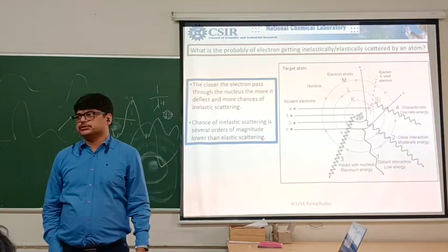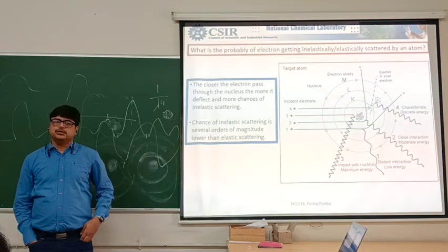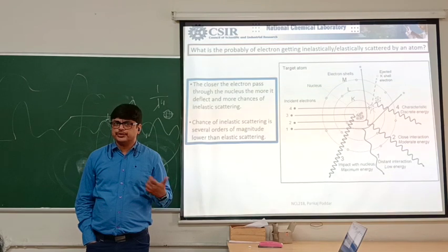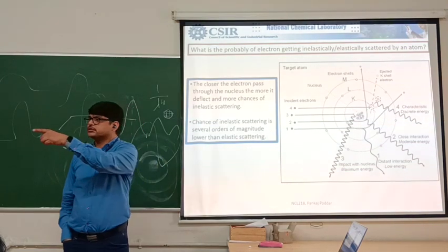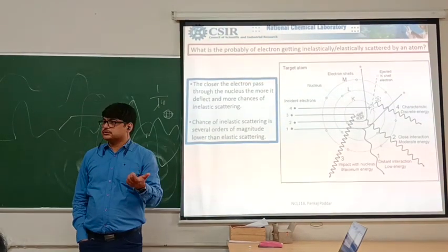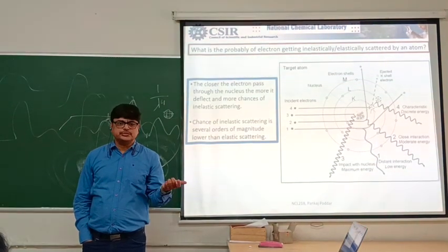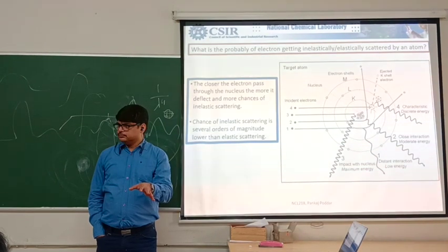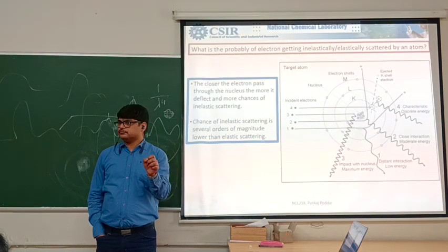It happens a lot with polymers, and with polymers you can have damage. You can damage polymers also. I will show a lot of images. I think we discussed in the first class the damage using the electron beam, right? Who asked this question about gold, right? Yes. Gold melting we discussed in the last class. You can have damage even in quartz, which is crystalline silicon oxide. Quartz is nothing but silicon oxide, right? Yes. So you can have bubble formation if you bombard with a high energy electron beam, you can damage part of it, and you can have quite a lot of local heating.